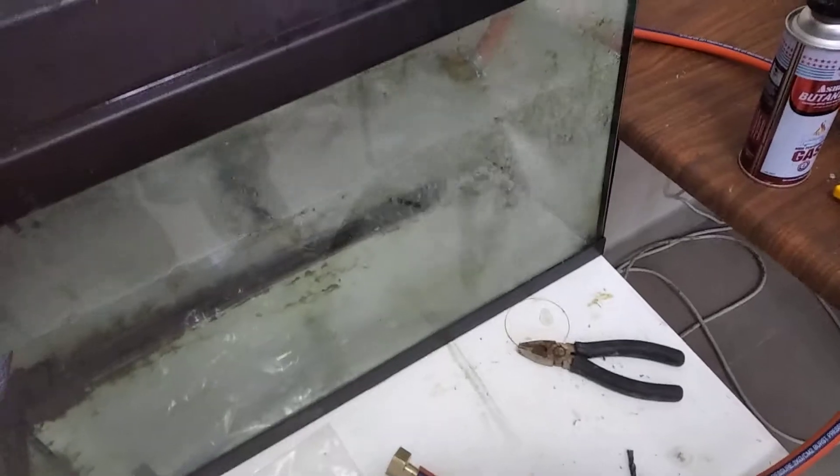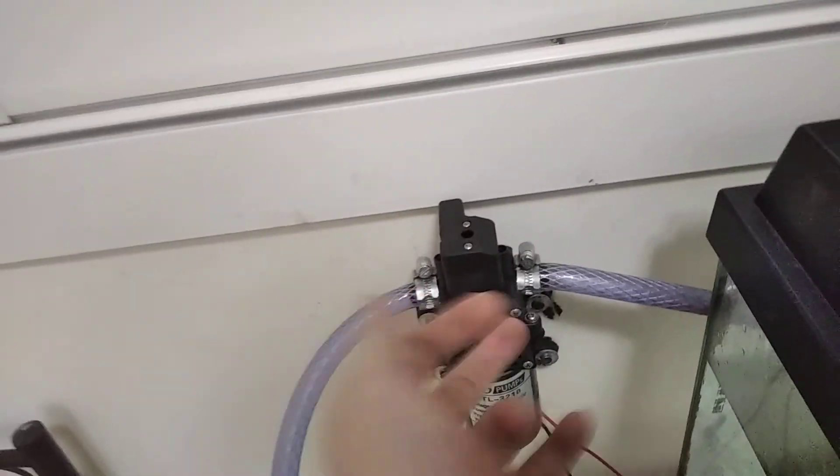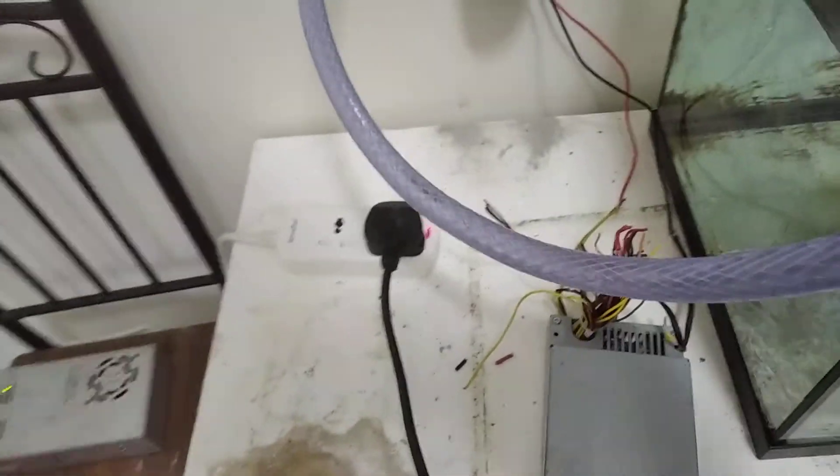That means it all works — no leaks over here. Pump is secured to the wall. And it's quite noisy, but that's fine.